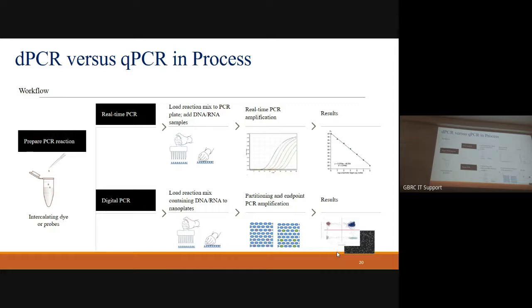But here in the Kaizen, the workflow is very similar to RT-PCR. Like the same, we are making the mixture and then we are loading into the plate and then we are analyzing.